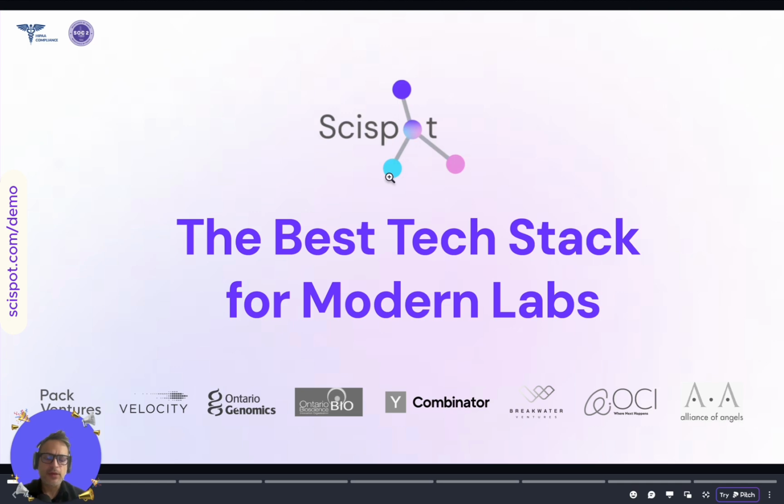I'll also cover one real world example of running an enzyme activity assay, then maybe talk about flat APIs and how some legacy LIMS and ELN systems have a nested API structure, and how that's reducing productivity and widening the gap between wet lab and computational folks.